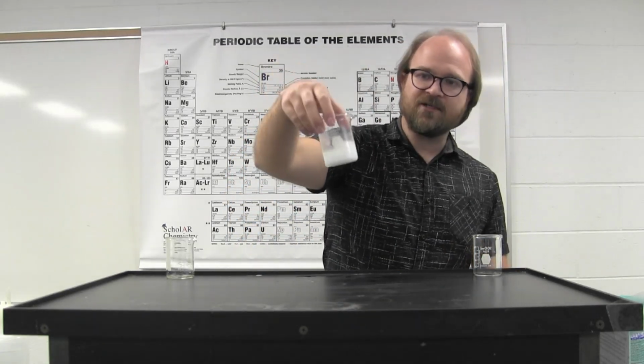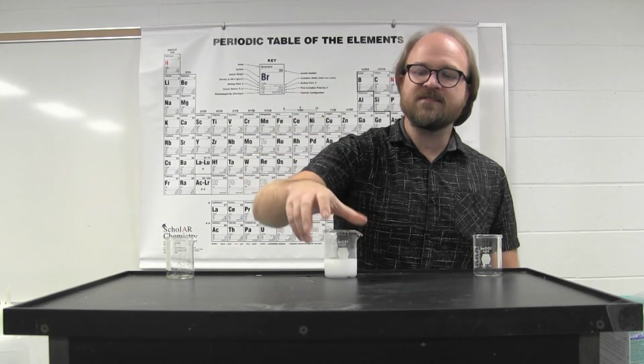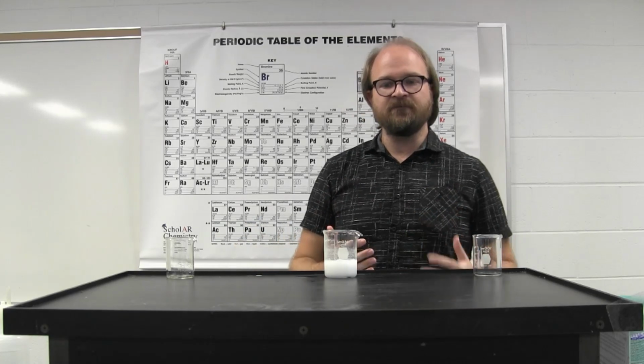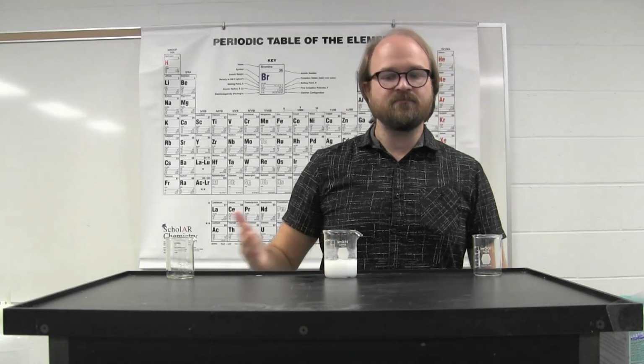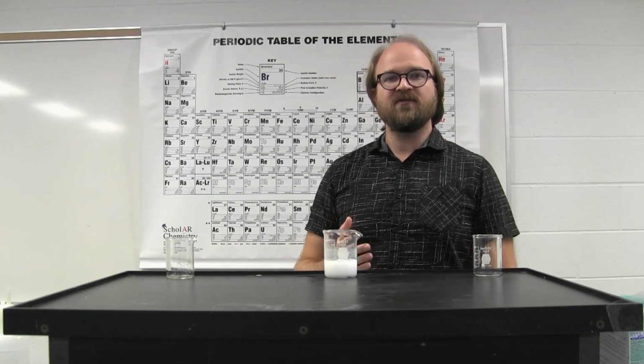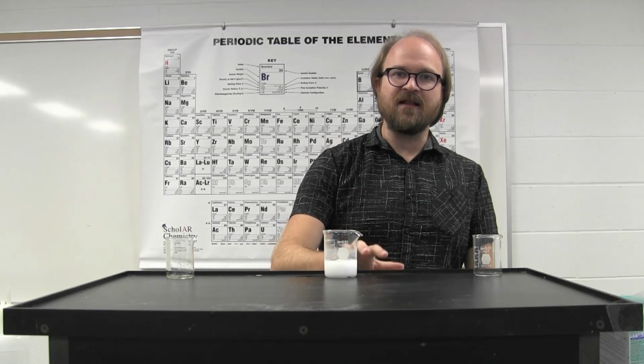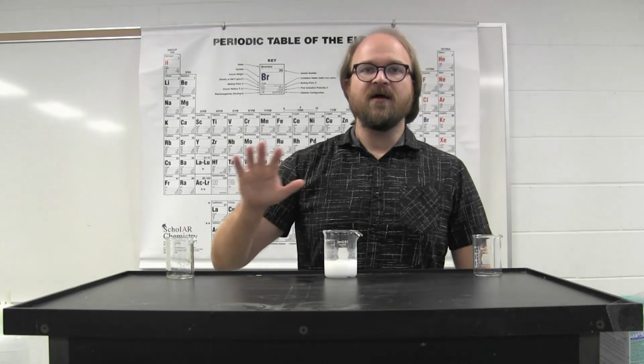But in other reactions, you'll be able to see the precipitate settle out to the bottom initially before too long. And in this reaction, in part B, you're looking at a few different precipitation reactions, and you're going to be separating the precipitate, the solid material, from the liquid material using filter paper.